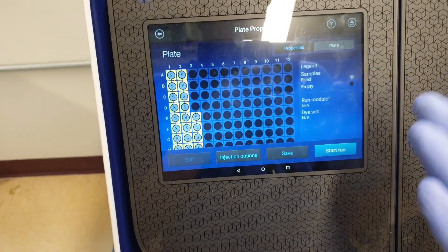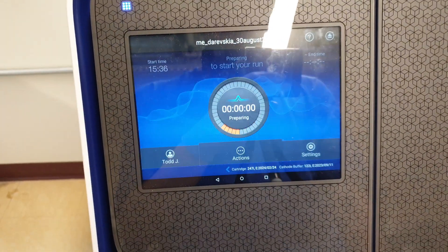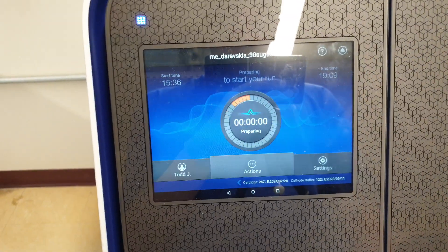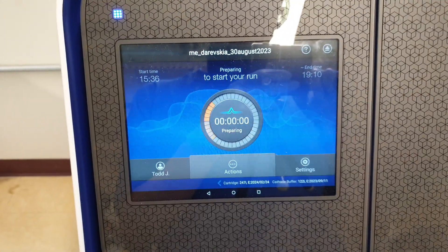So right now it's ready to go. Once we click on Start Run and OK, it's going to start the process. And this will take about three and a half hours. That's it.